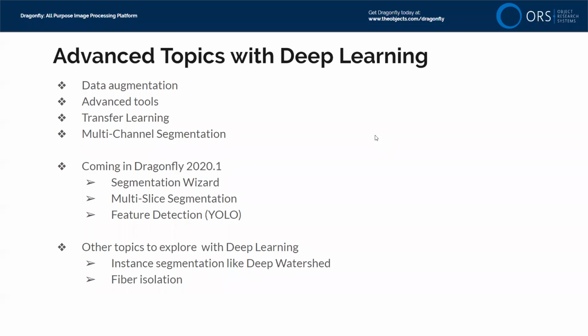So, for example, I think within 1 year, somebody, maybe it'll be us if you want to collaborate with this, will have a mitochondria detector, and it will be as robust as you or I are, and it will work on SEMs and TEMs of all different images. But what it requires is a large, diverse training set. So if you want to participate in that and you're already imaging mitochondria and you've got dozens of micrographs, send them to me and we'll write a paper together. So that's the sort of thing I think we'll have within a year.